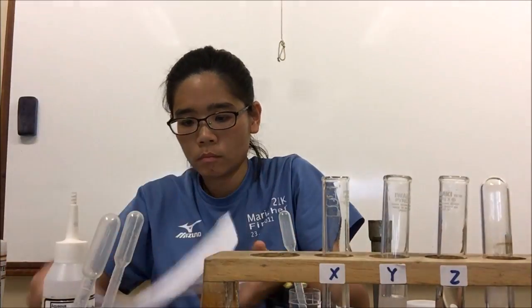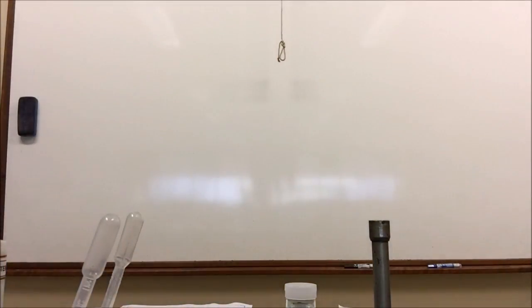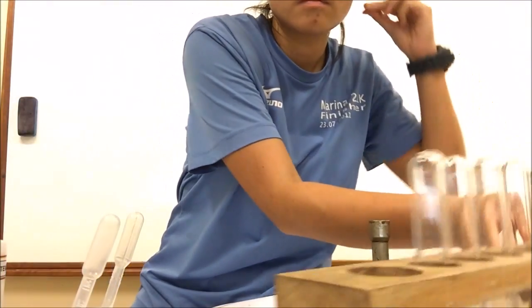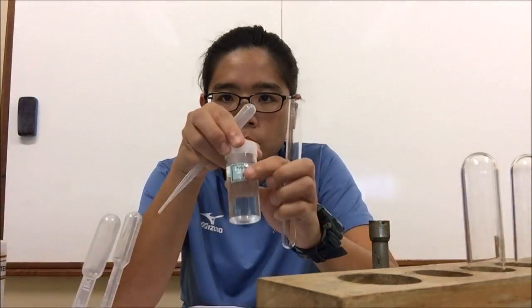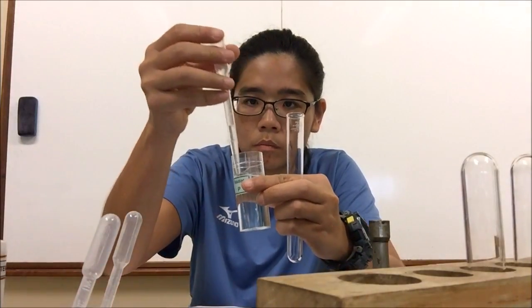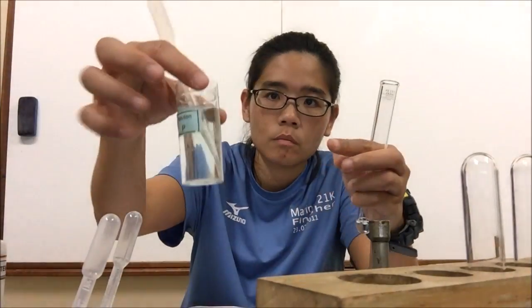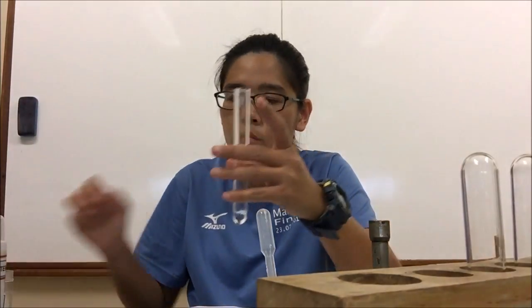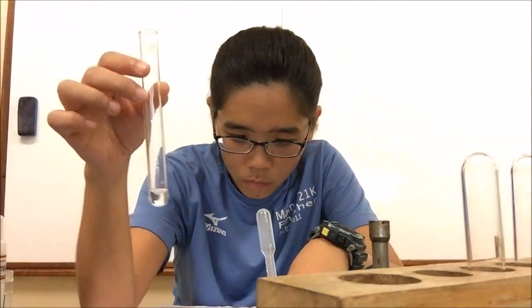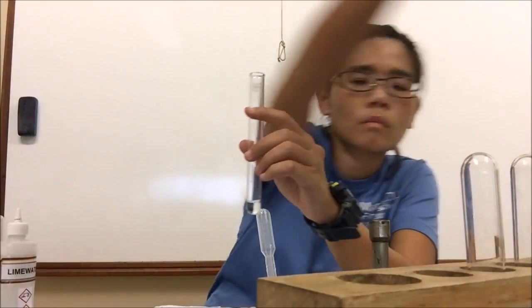You could tidy up your bench — just make sure you have enough space to carry out the experiment correctly. We are now given solution P. We transfer solution P to a test tube using a dedicated dropper so it is not mixed with X, Y, or Z. We add the reagent and get a precipitate. This is the classic cation test — we get a green precipitate.